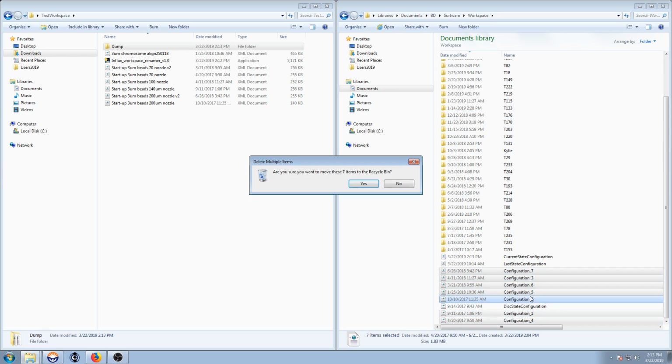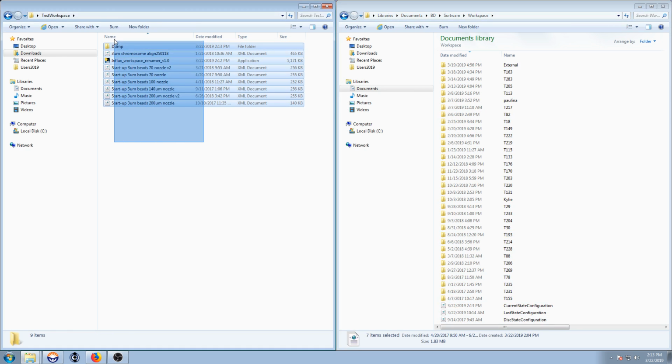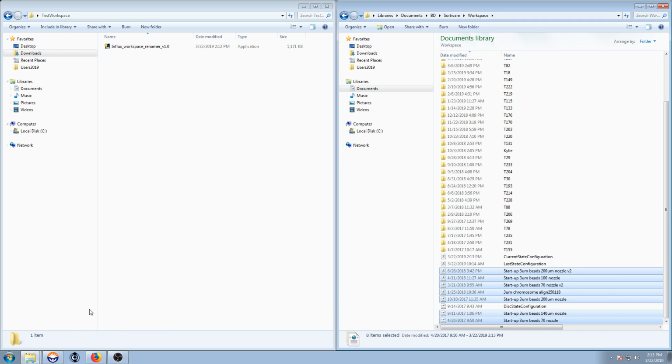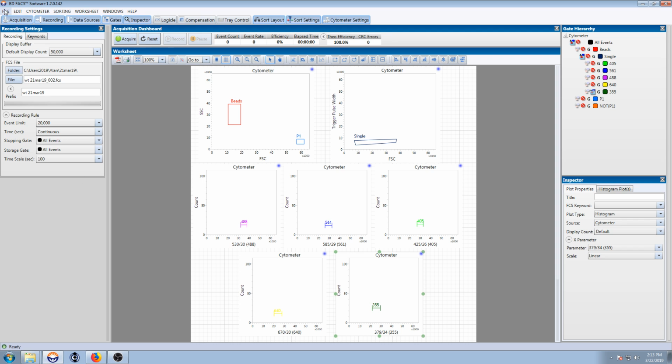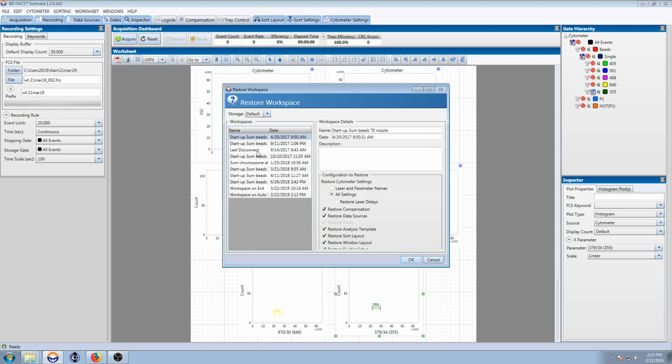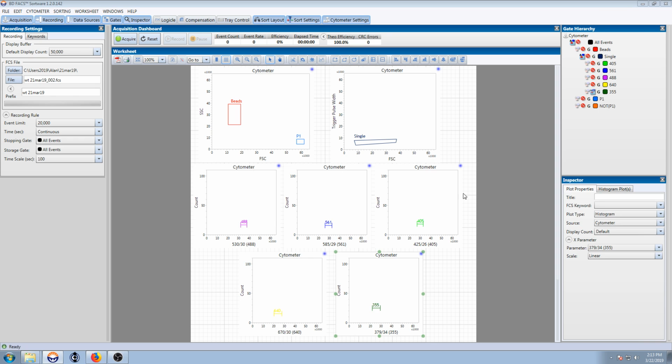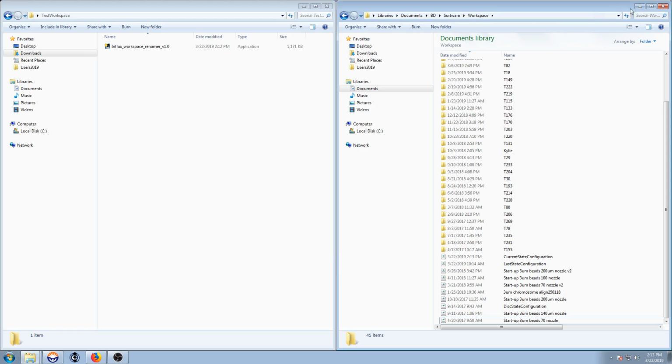installation of the software and bring these in, and then in the software you'll see that we can still load them. They're still here, despite having different names, and they still will load successfully. So if you want, you could apply this script to this folder, but we just apply it to a backup folder for safety's sake.